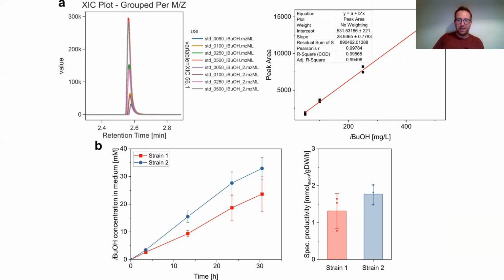Yeah, I think that was already it. I hope I could show you that the GNPS dashboard is a very useful tool also for metabolic engineering labs like ours, where we don't use that advanced mass spec methods, but we're just using mass spec for quantifying our compounds of interest and our metabolites. But still, especially if you don't have that many licenses of the original data analysis software, it's a very useful tool to switch from lab PC to office PC or even to home PC to work on the same data or share your data or work on the same data with your colleagues.